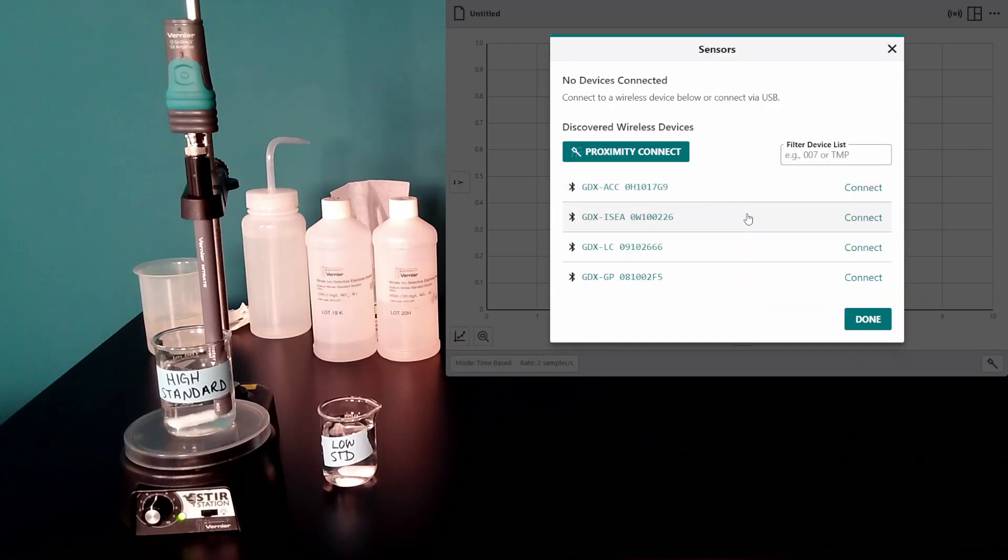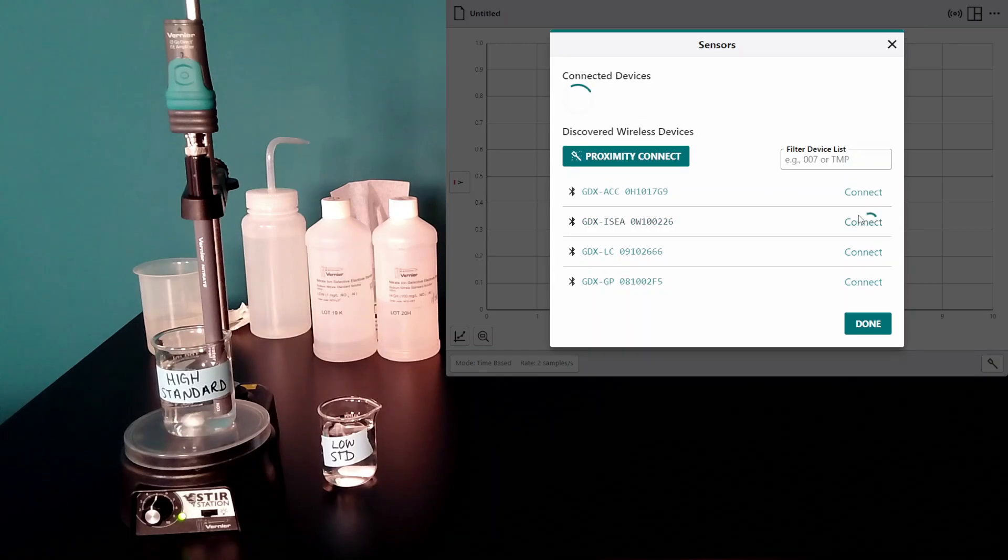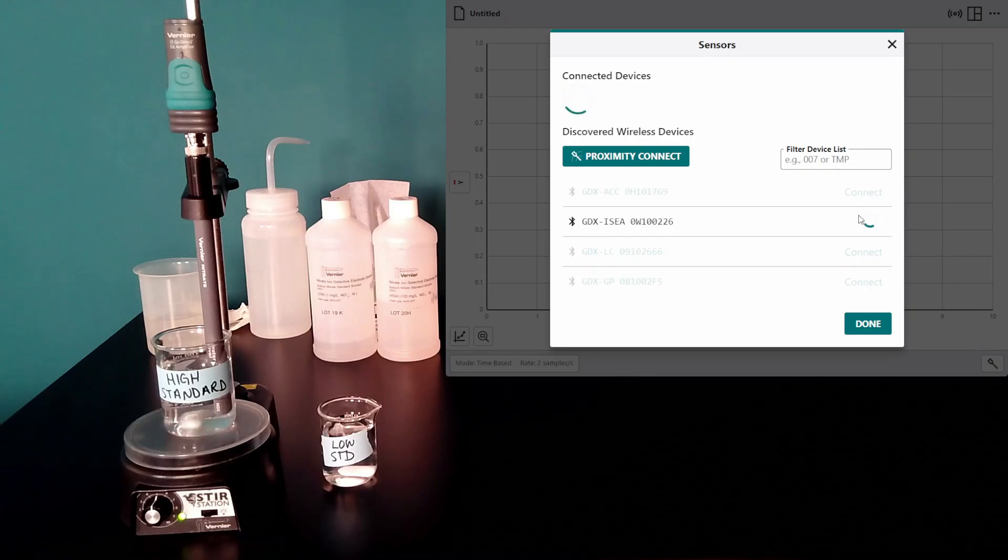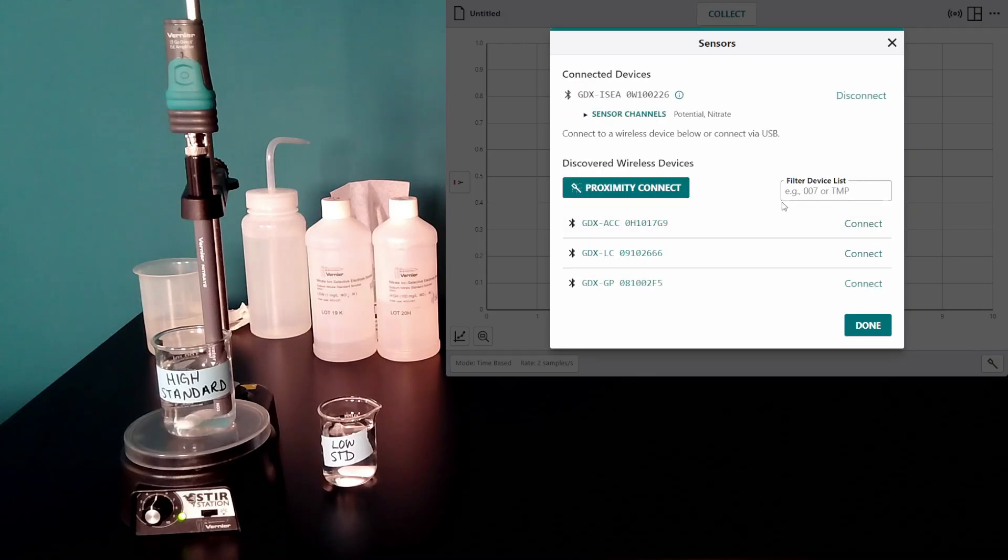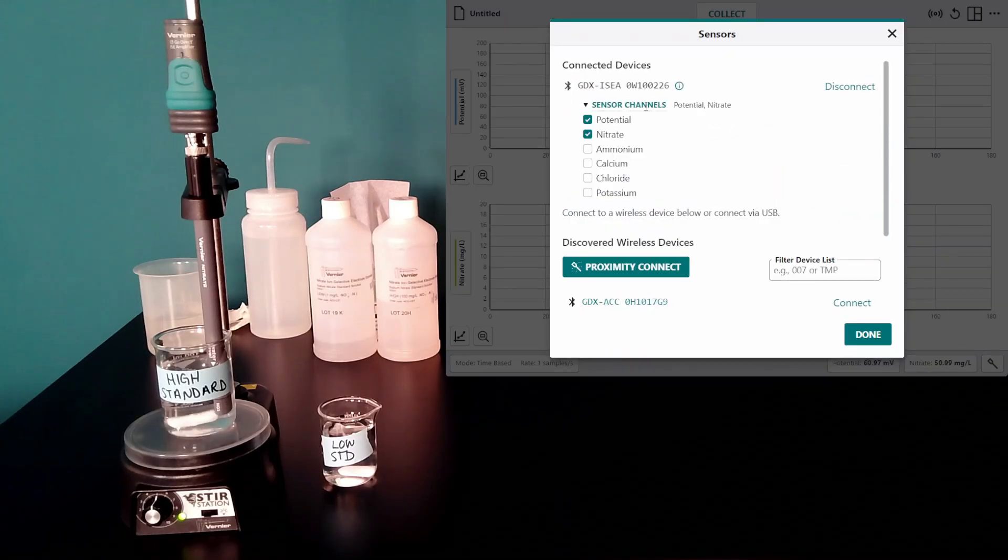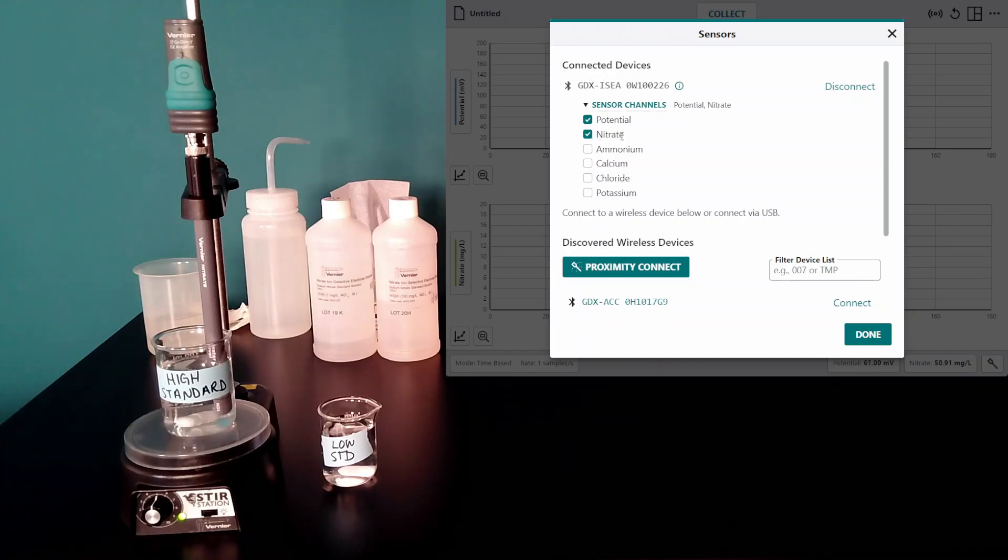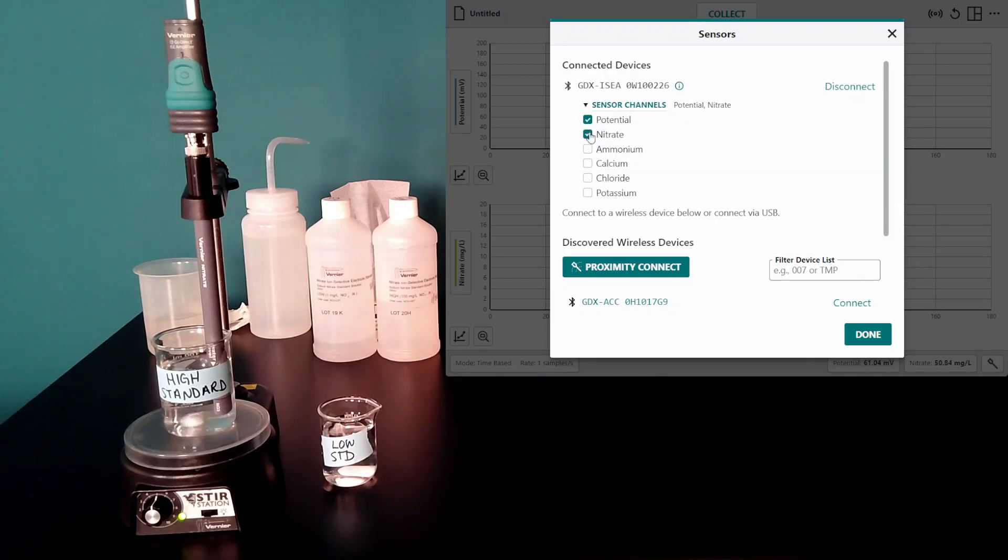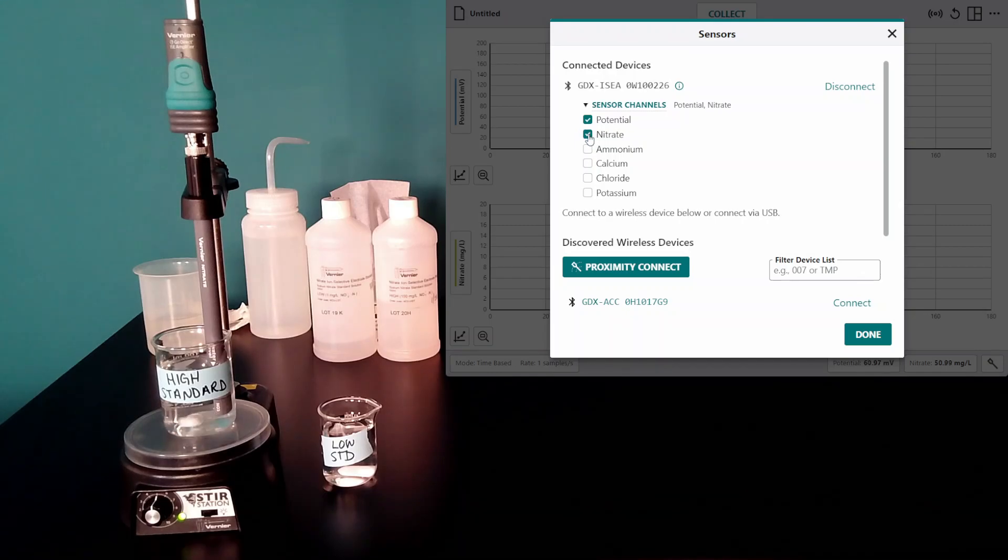I select it from the list of available wireless devices. And for troubleshooting purposes, it's very important that not only do I have the nitrate channel, which is typically on by default, I also want to make sure I enable the potential channel. So make sure both those channels are enabled to troubleshoot a nitrate ISE.